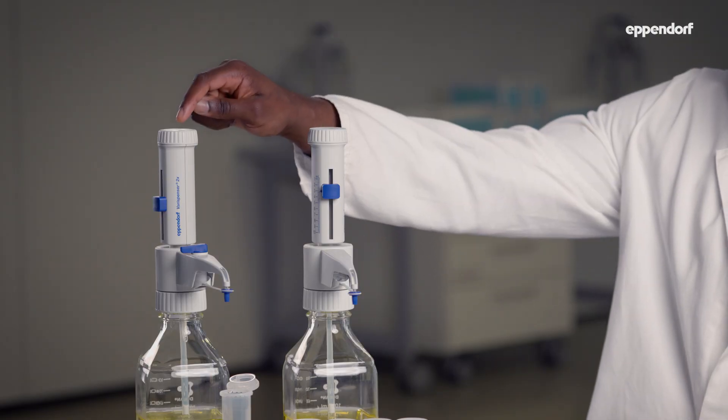Eppendorf's bottle top dispensers are the Varispenser 2 and 2X. The Eppendorf top burette is our bottle top burette. Our Varispenser family is great for dispensing aggressive reagents like acids, bases, and solvents. The top burette is suitable for titration solutions up to a concentration of one mole per liter.